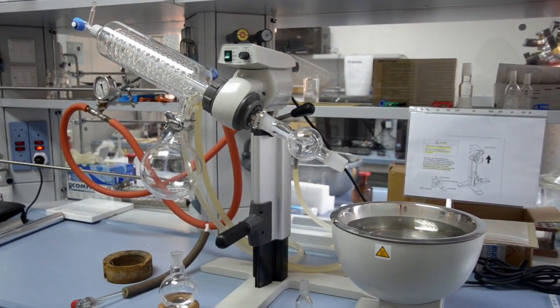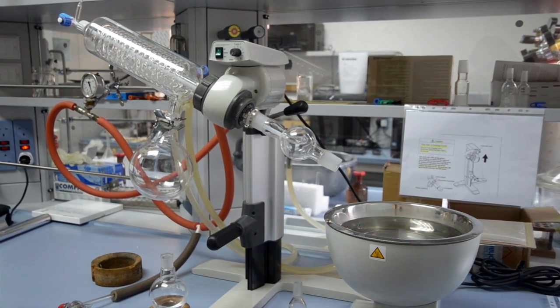The Waste Jar. This is where the evaporated solvents are captured and retained.